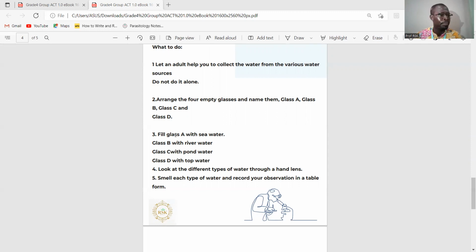All right, so we'll be looking at our very last one, and then we'll bring our section to an end. We have looked at the river water. We disqualify the river water based on the color, okay, and then the particles. Can you see the particles? You see this thing? Okay, let me try and shake it a little.